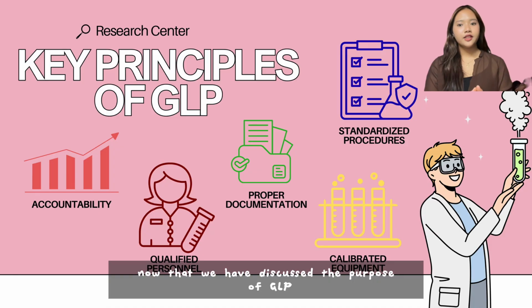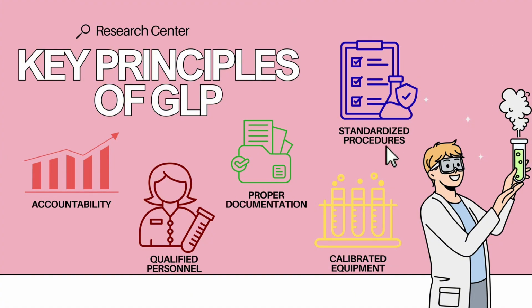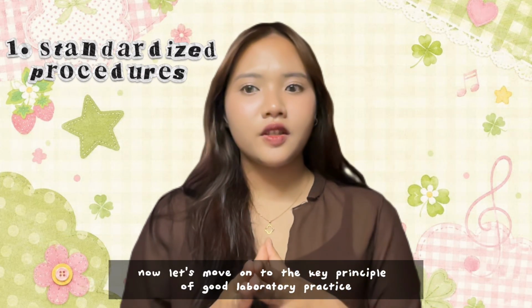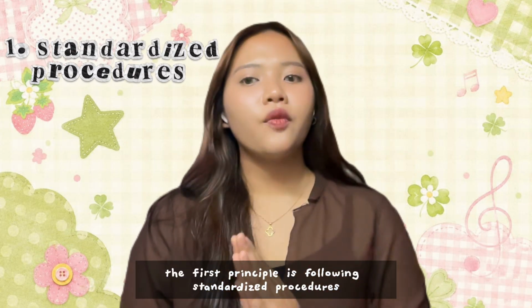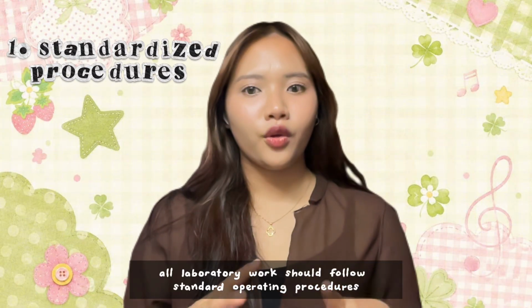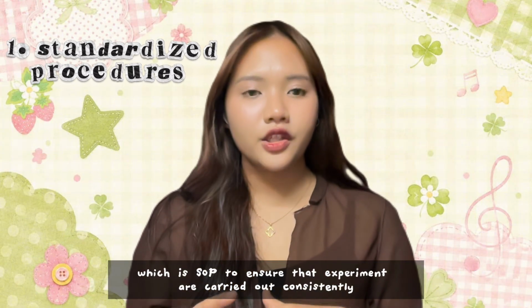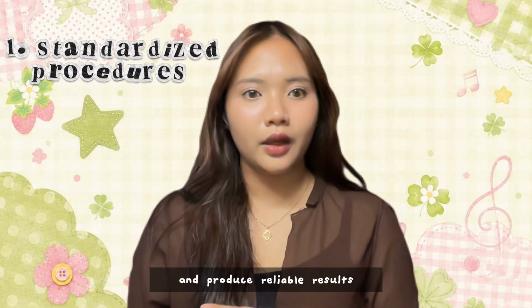Now that we have discussed the purpose of GLP, let's move on to its key principles. The first principle is following standardized procedures. All laboratory work should follow standard operating procedures, or SOPs, to ensure that experiments are carried out consistently and produce reliable results.